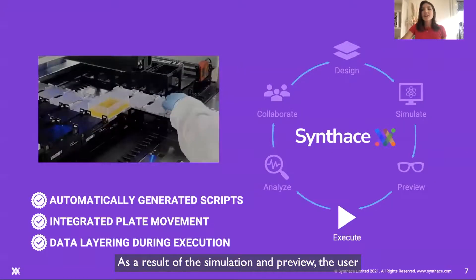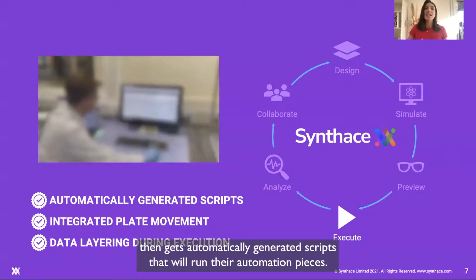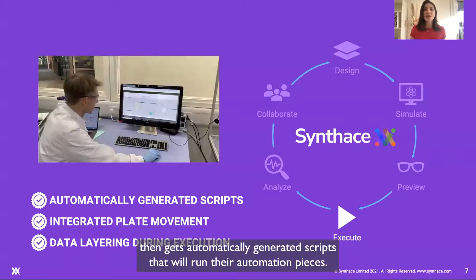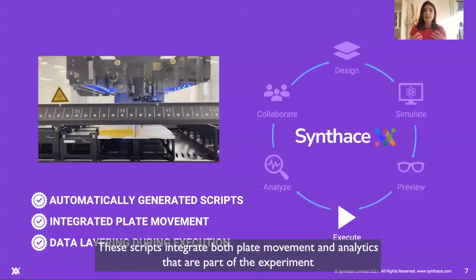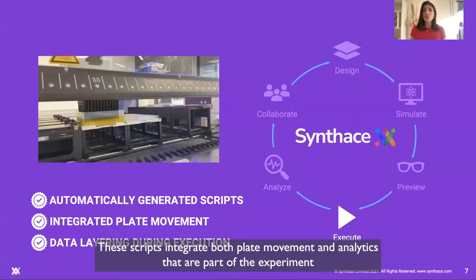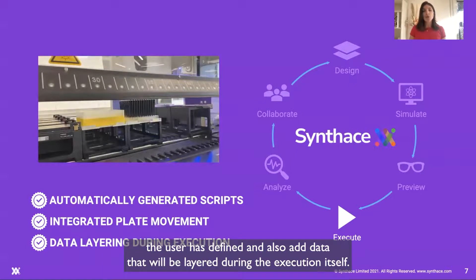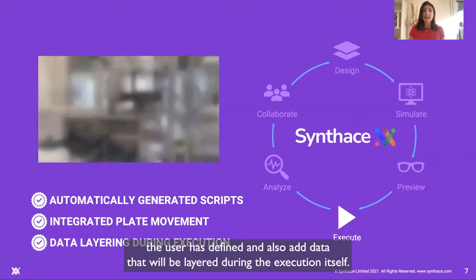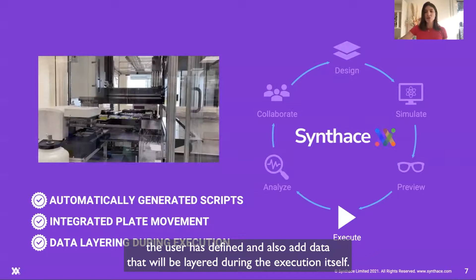As a result of the simulation and preview, the user then gets automatically generated scripts that will run their automation pieces. These scripts integrate both plate movement and analytics that are part of the experiment the user has defined, and also add data that will be layered during the execution itself.